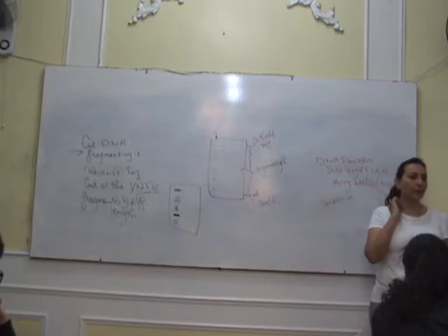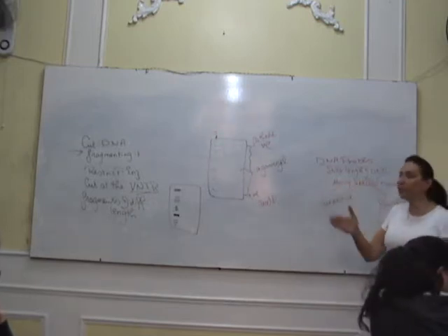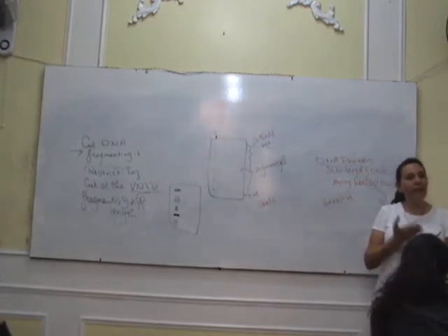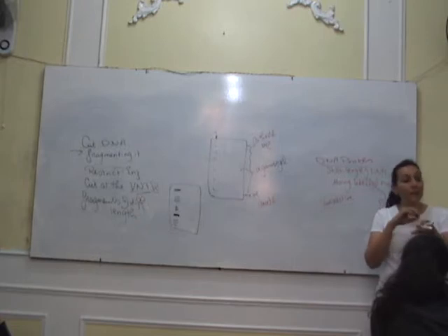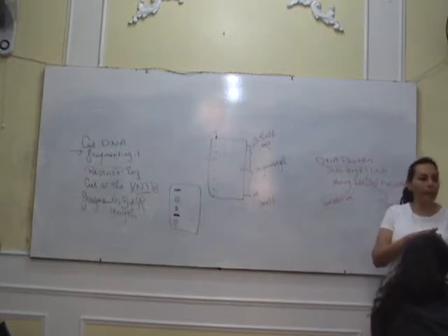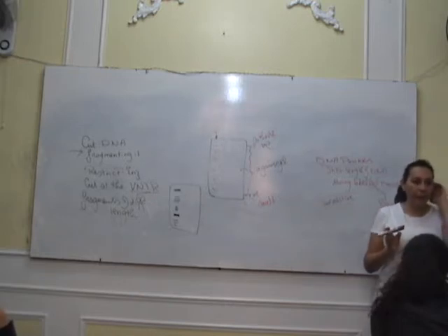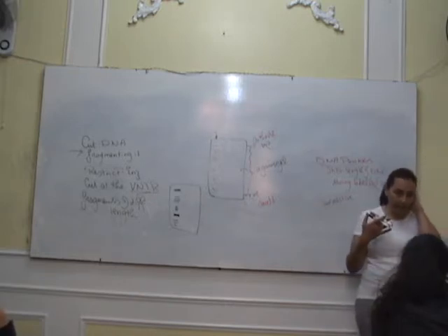Yes, after we make the gel electrophoresis and we separate the fragments, we do heating to convert the double strands of DNA to single strands, then you add the probes. Yes, you put them and they start to move and bind to the target by complementary base pairing, so they start to show the bands.